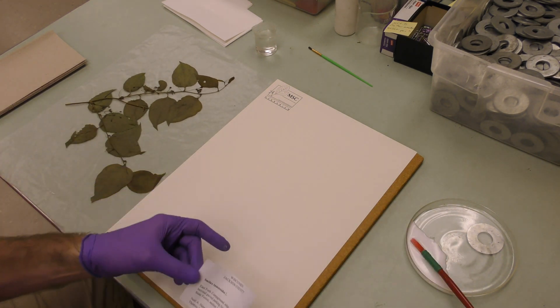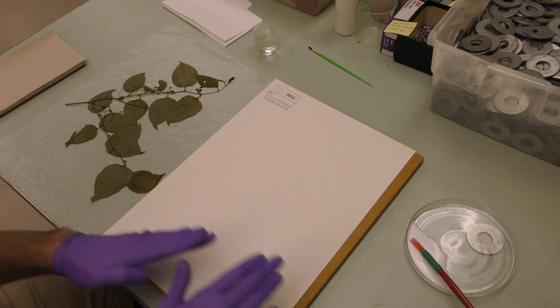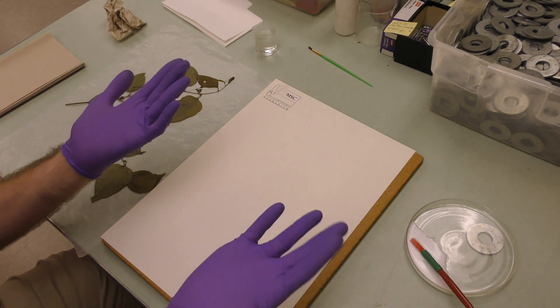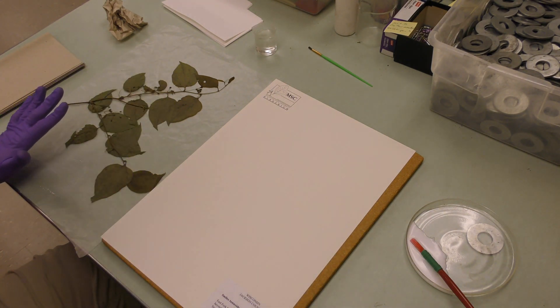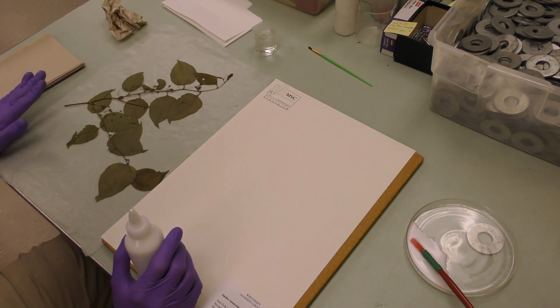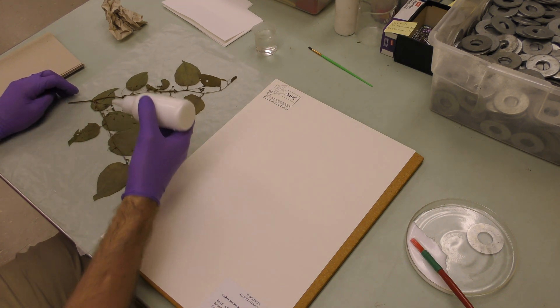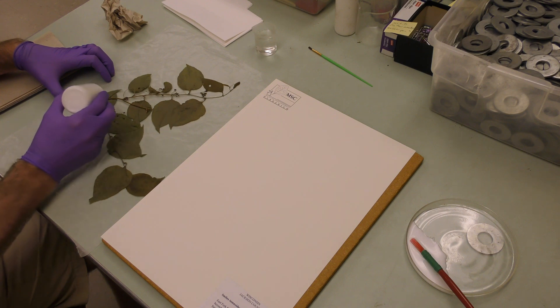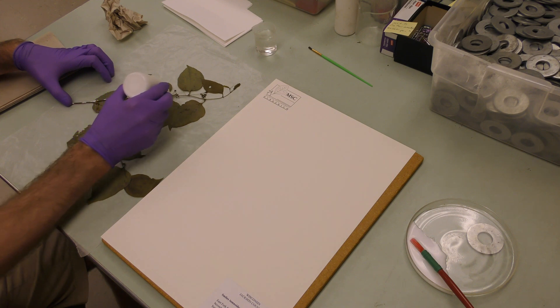I'll just quickly get that on there. You don't want too much glue because it'll start to wrinkle up later on and it looks a little ugly. Part of the goal — aside from making sure the specimen is secure so that it will last hundreds of years — is to make it look nice at the same time. So with these plant specimens, less tends to be more. Usually the way we do it is going up the stem like this, just dotting. It's pretty good glue, so if you get the stems and a little bit on each leaf, it's really not going anywhere.